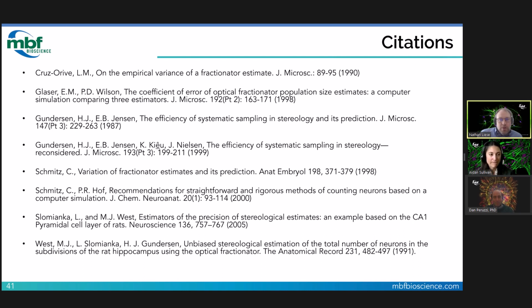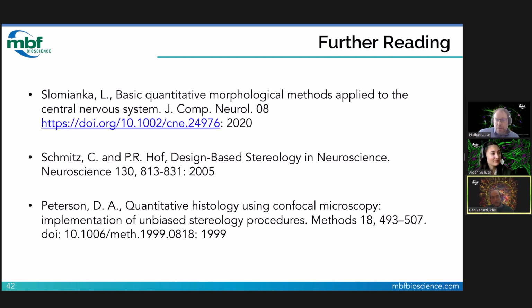Well, that's all, folks. Thank you, Aidan and Dan, for walking us through this comprehensive example of a pilot study. Here you can see some of the resources that Dan and Aidan used to put this presentation together. Those are mostly for the CEs and things like that. These are some reviews we recommend that will go through the things that we did today about a pilot study, and also a lot of other information about unbiased stereology.